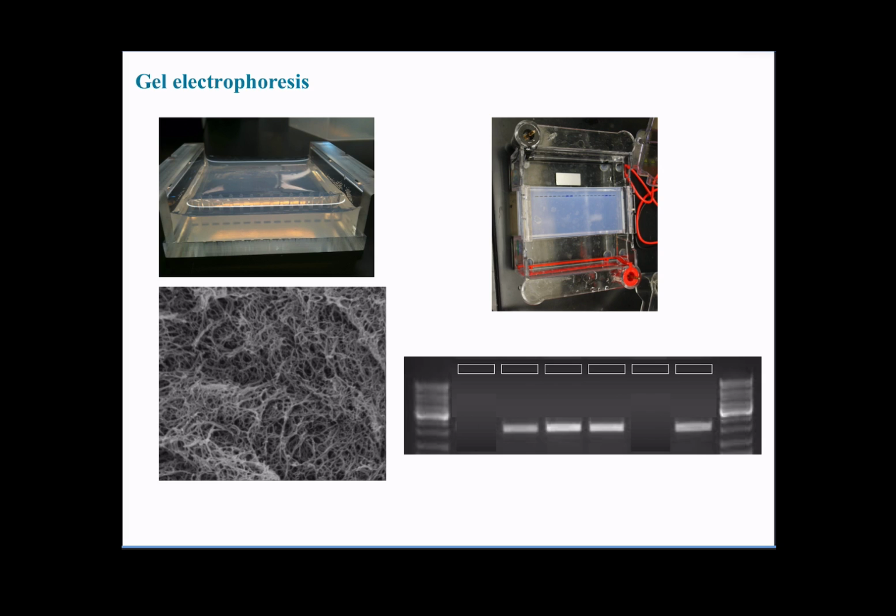We let the samples run for a little while, and if the PCR reaction works, there should be millions and millions of copies of the same fragment that are going to migrate together, and that we should be able to see easily when we stain these gels with these fluorescent chemicals, because there are, once again, billions, if not trillions of copies of these fragments. They will all pick up this fluorescent molecule, and when we hit the gel with UV, they will emit all of that light that we can easily see.